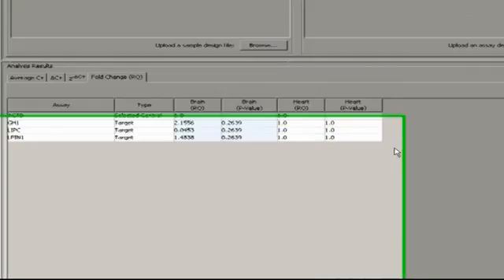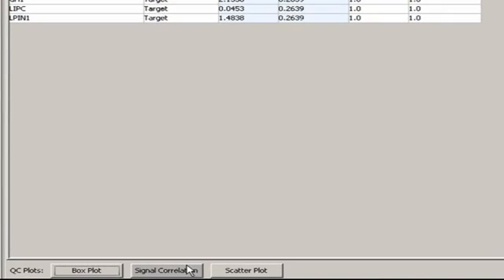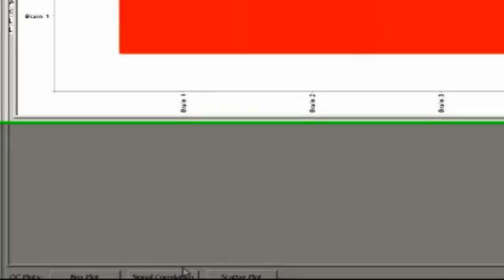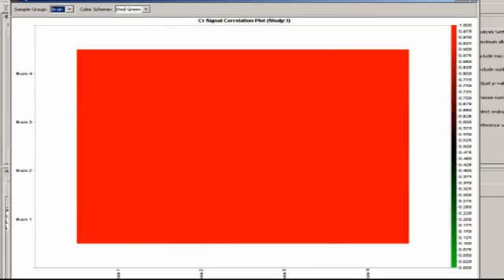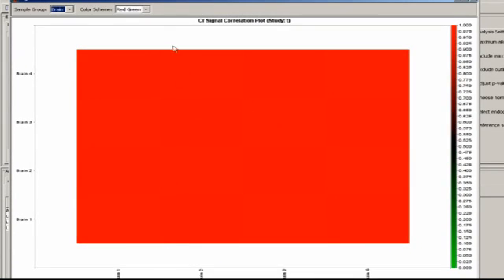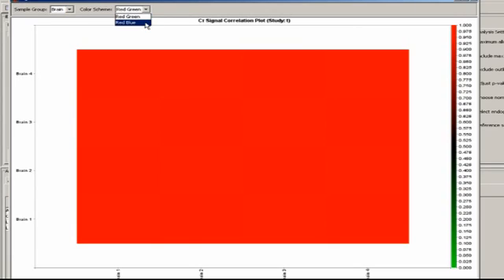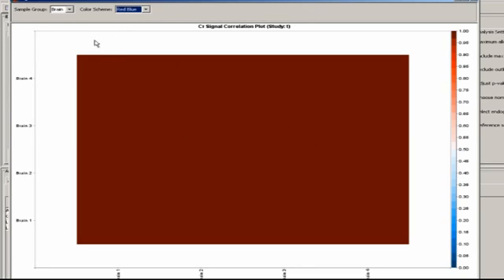The signal correlation plot, which only shows data when biological replicates are present in the study, uses either a red-green or a red-blue color scheme to indicate the correlation in CT among the various samples in a sample group.